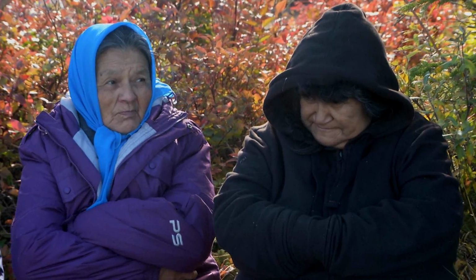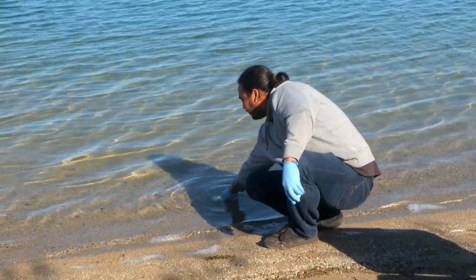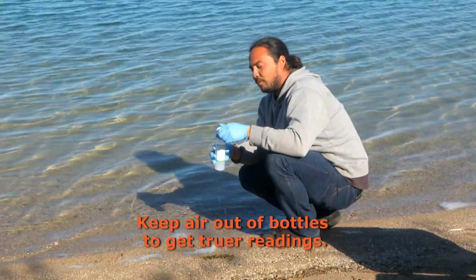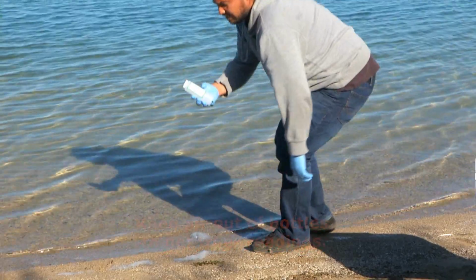And also, one thing you want to remember when you're filling up the jars, you want to keep as much oxygen out of the jars to relieve as much change to the water. The more oxygen that's in it, the more it'll change our readings the longer we're out here.